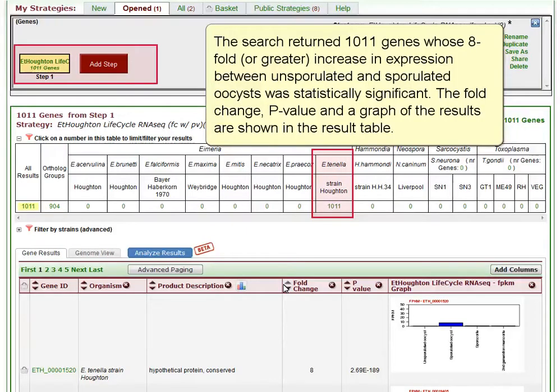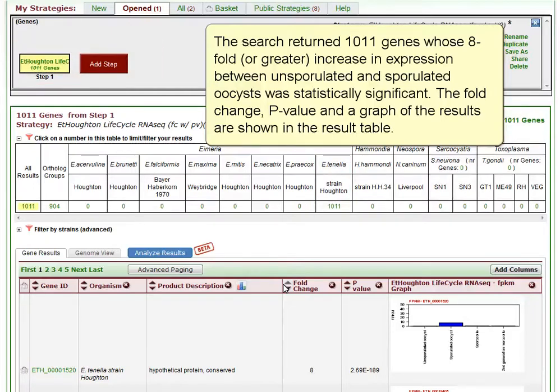The search returned 1,011 genes whose eight-fold or greater increase in expression between unsporulated and sporulated oocysts was statistically significant. The fold change, p-value, and a graph of the results are shown in the result table.